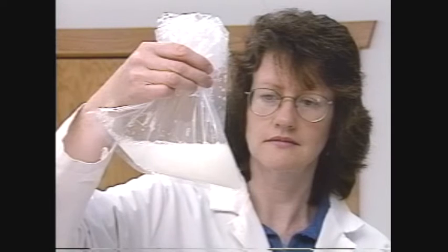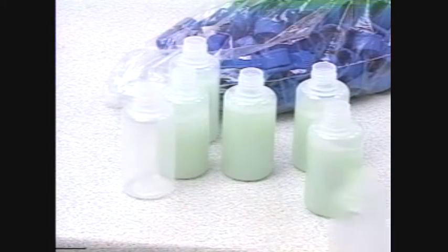If a large volume of white or cream-like semen was collected, 12 to 15 doses can probably be made, since the sperm concentration is probably very high. If, however, the ejaculate is low in volume and appears cloudy or skim milk-like, then only approximately 4 to 6 doses should be prepared because the sperm concentration is low. Estimates of the number of doses that can be made should be done conservatively in order to be certain that enough spermatozoa are in each AI dose.